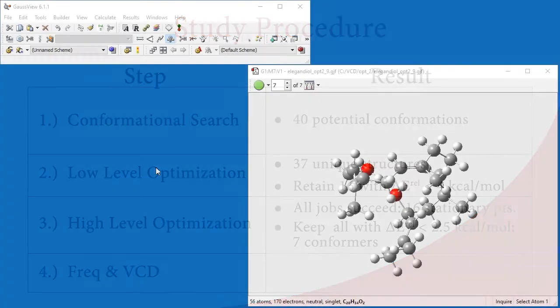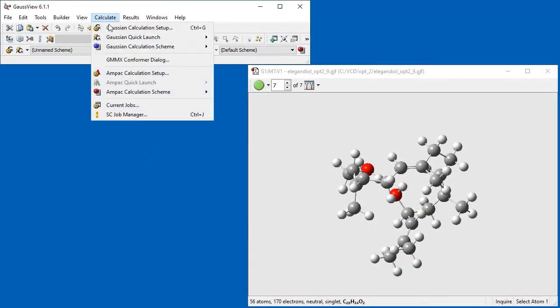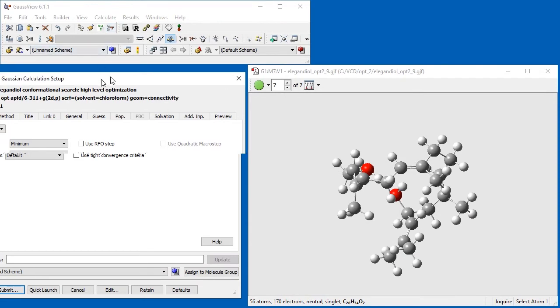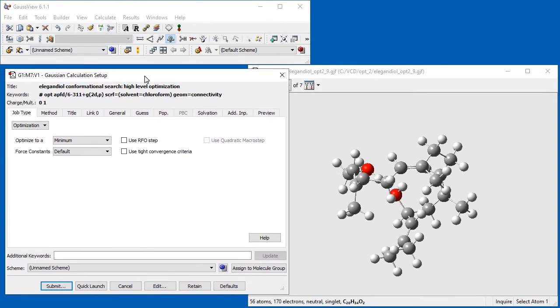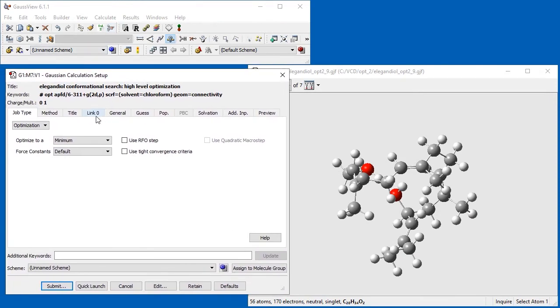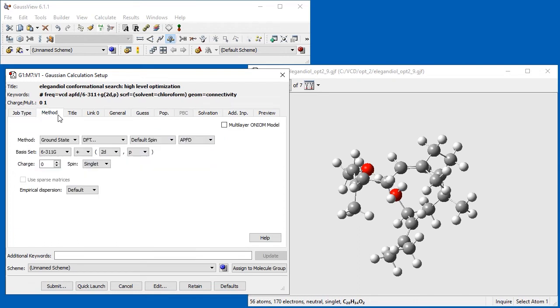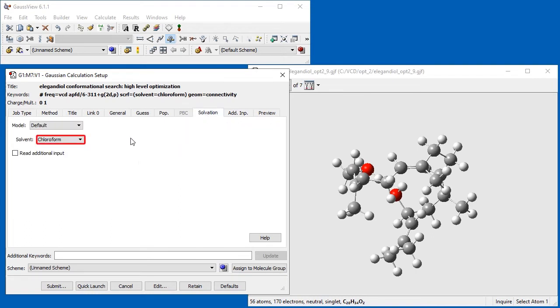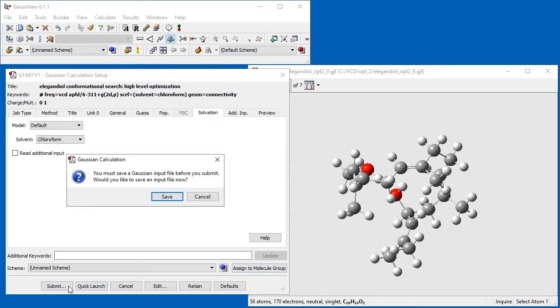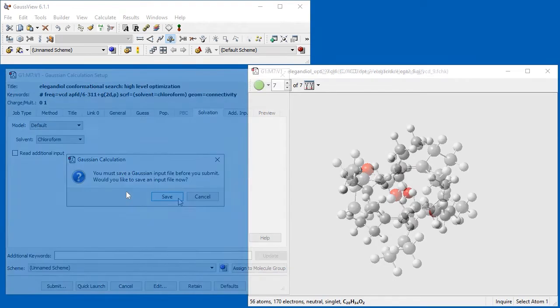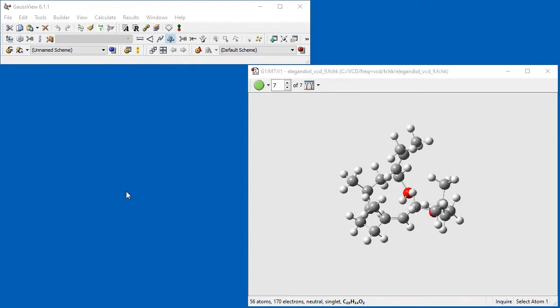We open the Gaussian Calculations Setup dialog and set the job type to Frequency. We select the Compute VCD checkbox. Next, we specify our standard model chemistry. We also set Chloroform as the solvent. As before, we apply these settings to the Molecule Group, save each molecule to its own job file, and then run the jobs in Gaussian. Once all of the jobs complete, we again open the result files into a single molecule group.